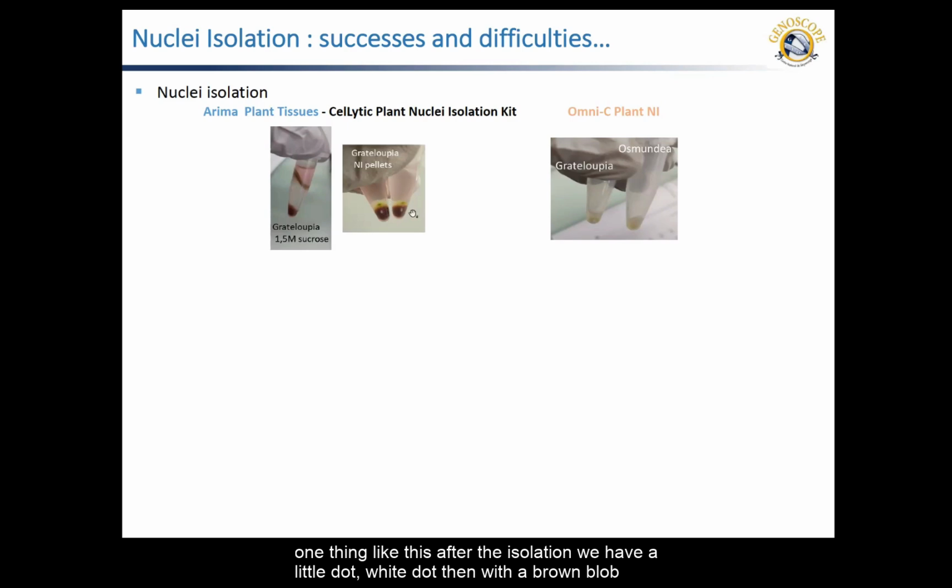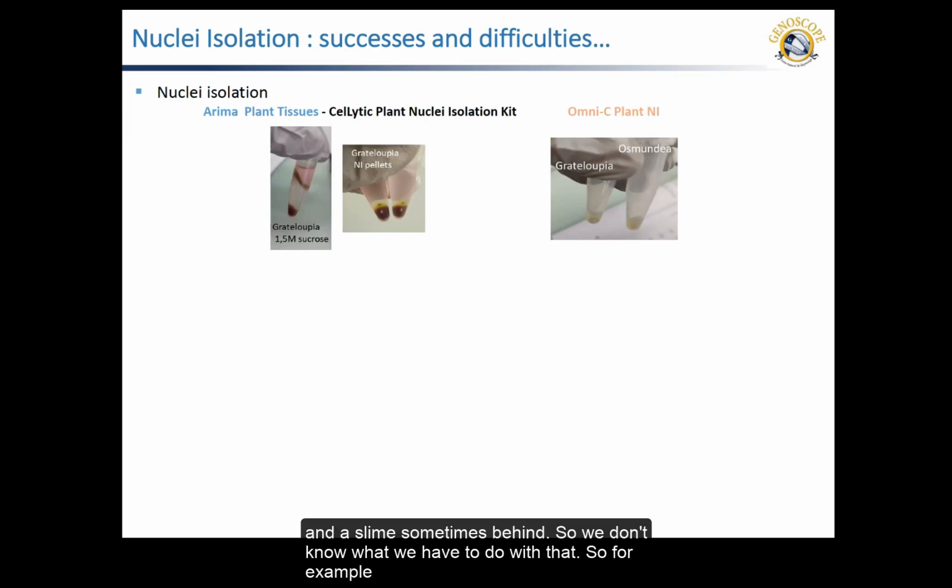Like this, after the isolation, we have a little white dot, then with a brown blob and slime sometimes behind.